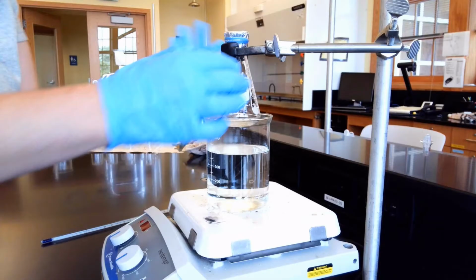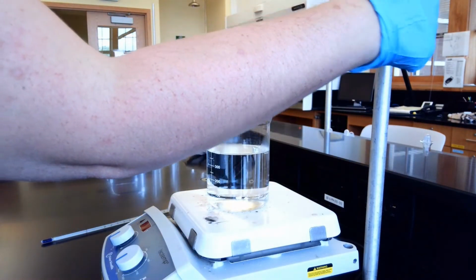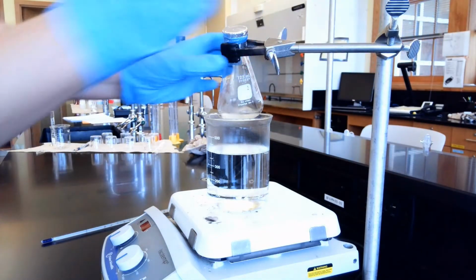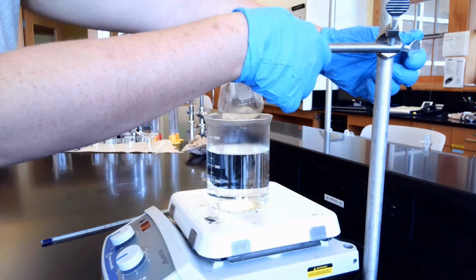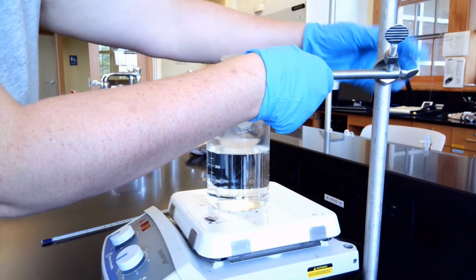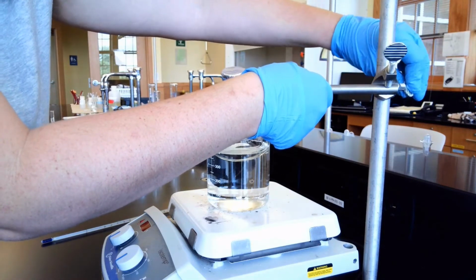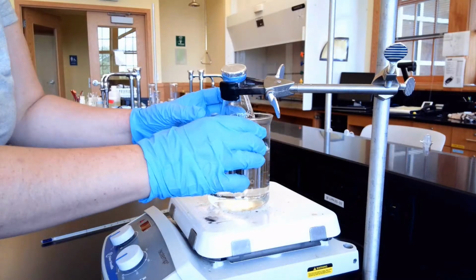What we're actually going to do to help us, because we have to see when this is fully gone, we're actually going to tilt this a little bit. This way we can see the liquid pooling in the bottom. And now we're going to lower this down so it'll be submerged in the water. And we're going to heat this up.